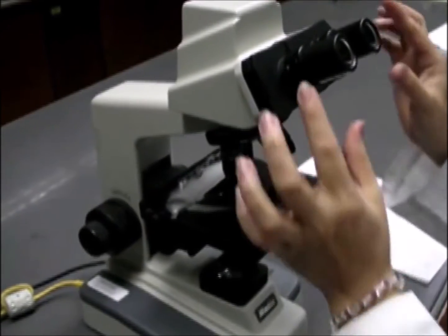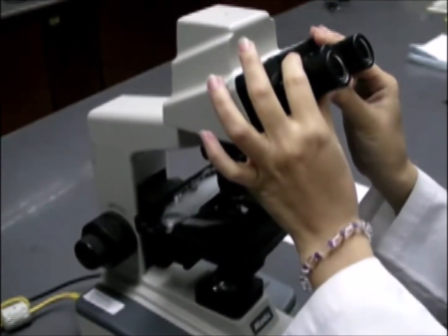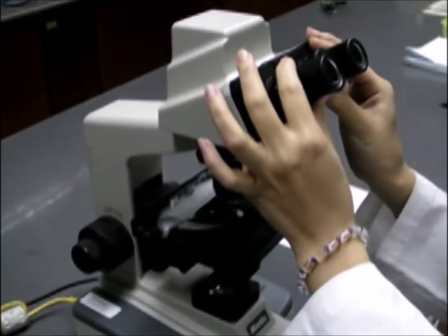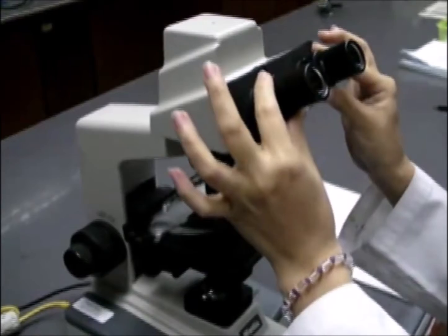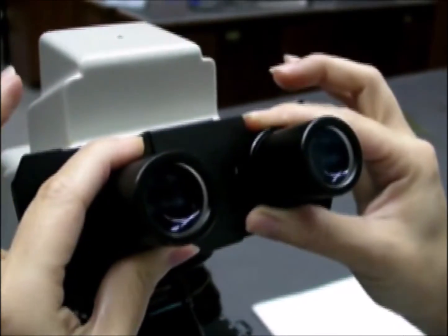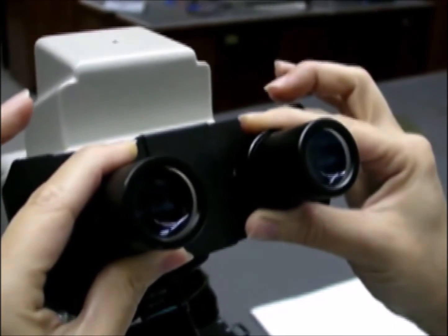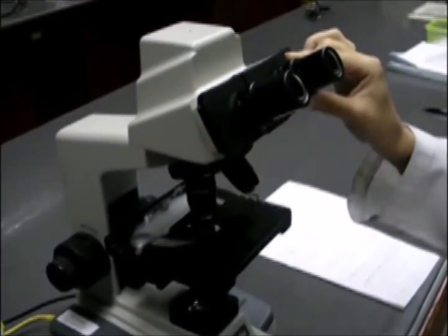This is a pair of binocular eyepiece which contains an eyepiece lens of magnification of 10 times. The width between the two eyepiece lenses can be adjusted according to the width between your two eyes, so that when you look into the microscope, you only see one image.